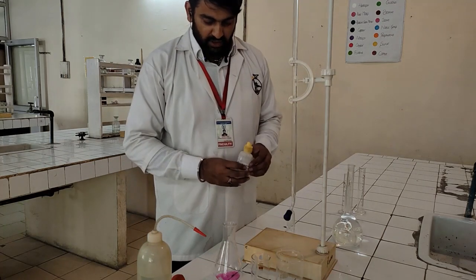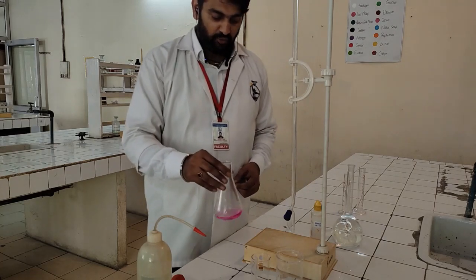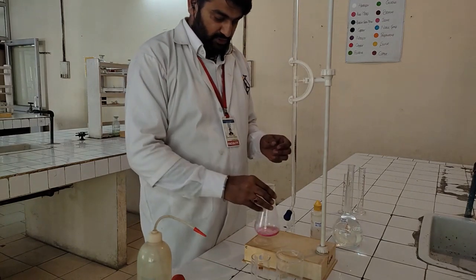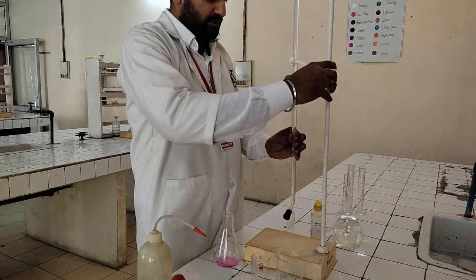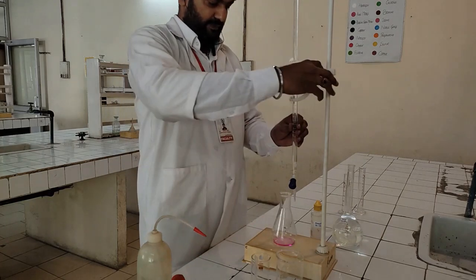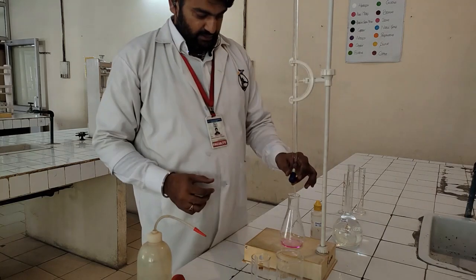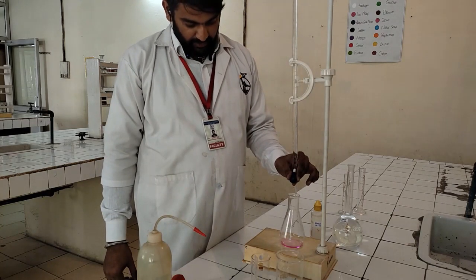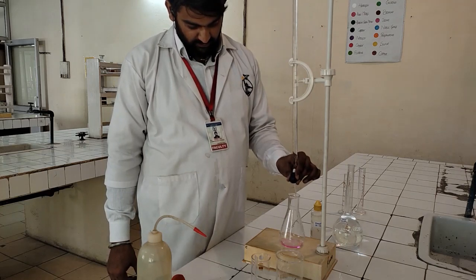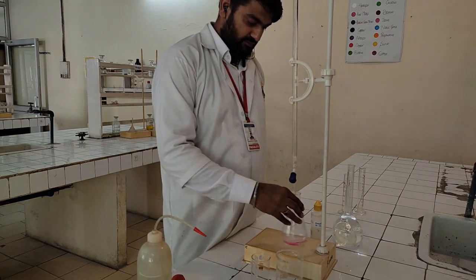As you have seen, I have already told that phenolphthalein is pink in basic conditions. Now we are going to perform the standardization of NaOH solution. So adjust the burette accordingly so that your flask can be easily placed. Start the burette so that 1 drop per second falls into the solution. Continue, swirl the flask.